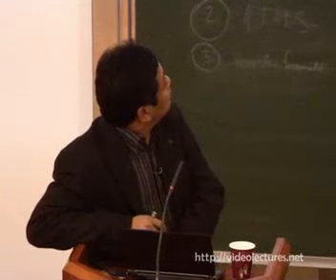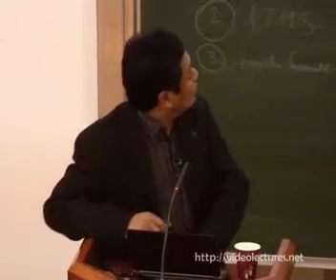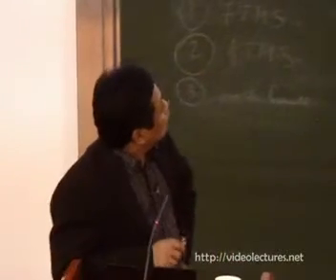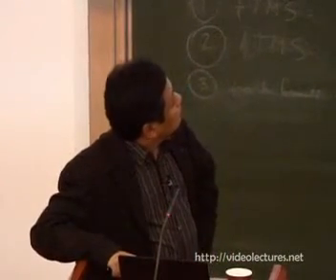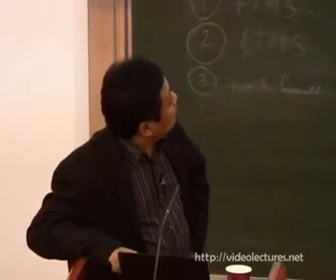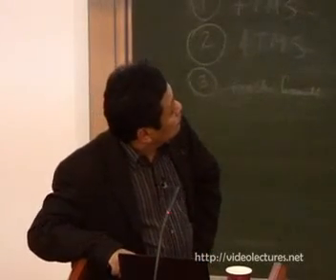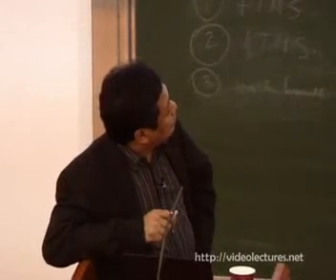All right, so these are some of the images from my group, my students building our home-built low temperature STM. Sorry, some of the images are cut off up there. I'm sorry about that. And this is the low temperature STM in my group at Ohio University, and this is the inside, how it works.